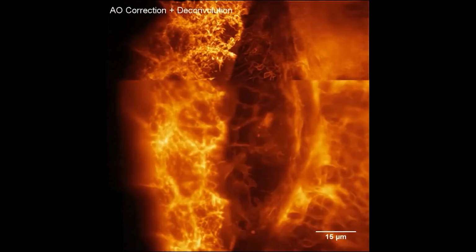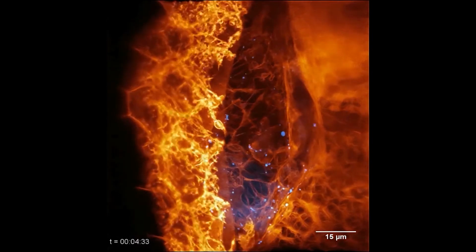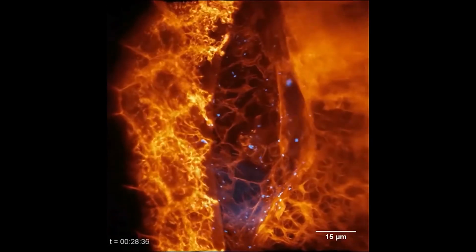And of course, you can turn it and continue the movie whatever you want, because it's a three-dimensional image. It's not just a static image. You can look at it from every conceivable angle. You can push through things. You can look through different layers.